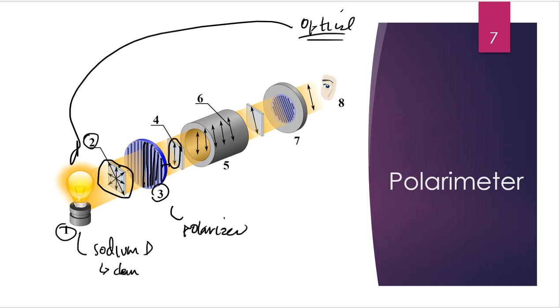And the reason that we're doing that is because this orientation of light is getting ready to slam up against our molecule. So in spot number 5, this is where our sample compartment is going to be. This is the area that I will load the sample up, and I will place my sample down.